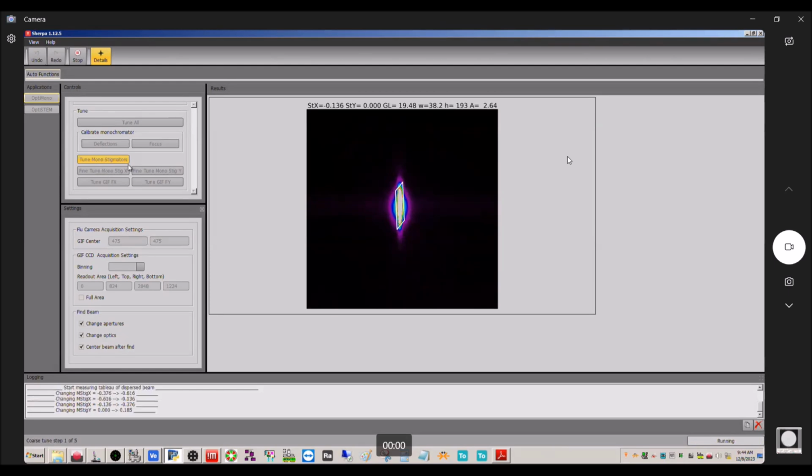You can try running both of these. I'm pretty sure this one won't work, at least according to the manual, but we can give it a try. I know these two definitely won't.